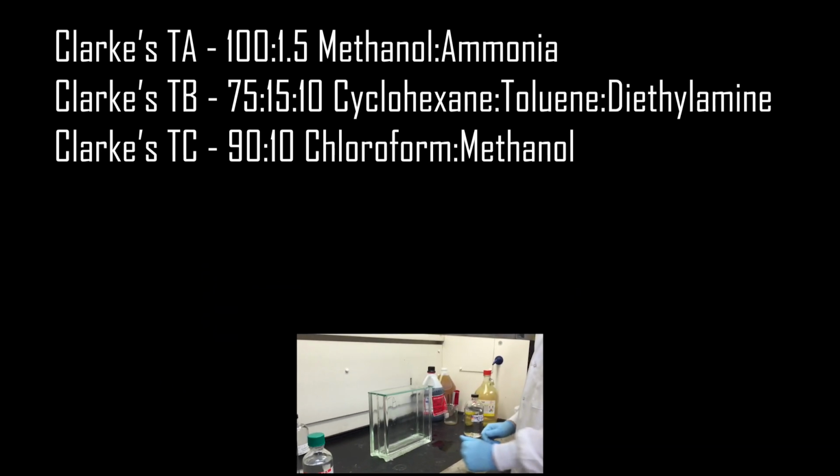The most common solvents that we use as mobile phases are going to be the systems in Clark's Analysis of Drugs and Poisons. Clark's TA is a ratio of 100 to 1.5 methanol to ammonia, and Clark's TB, which we will likely be using for this lab, is a ratio of 75 to 15 to 10 cyclohexane, toluene, diethylamine. Clark's TC is also run sometimes. You see it there. There are some other systems listed in Clark's, and if you're looking for a particular drug, it can be a good idea to look up in Clark's what the RFs are for that drug in different systems, to give you an idea of what systems it runs in and what systems it just sits at the origin.